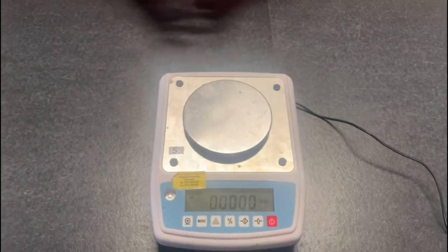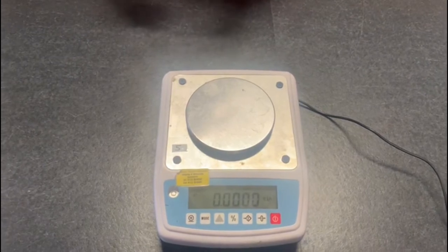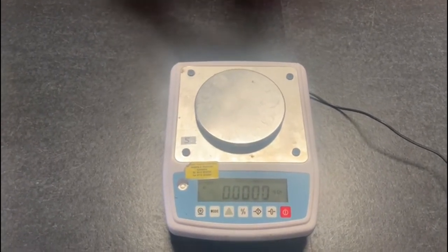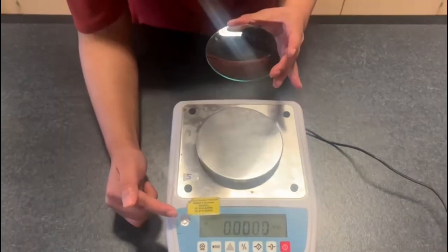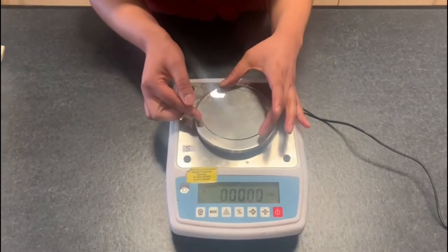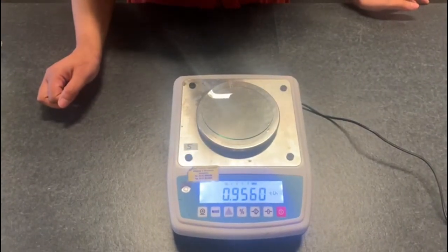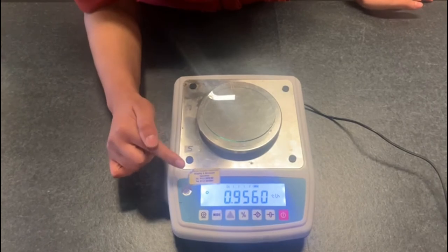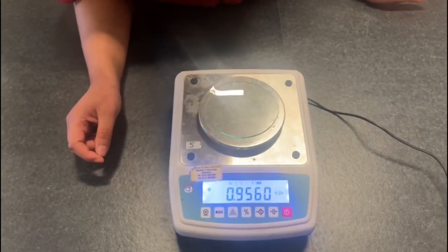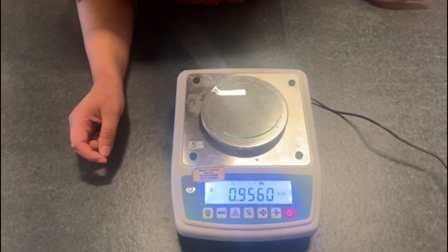I'm now going to talk you through activity 2. First thing we need to do is weigh a clean dry watch glass. So make sure that the balance is at zero before placing the watch glass on. We then need to write down the mass of the balance onto our results table. So it is 0.956.